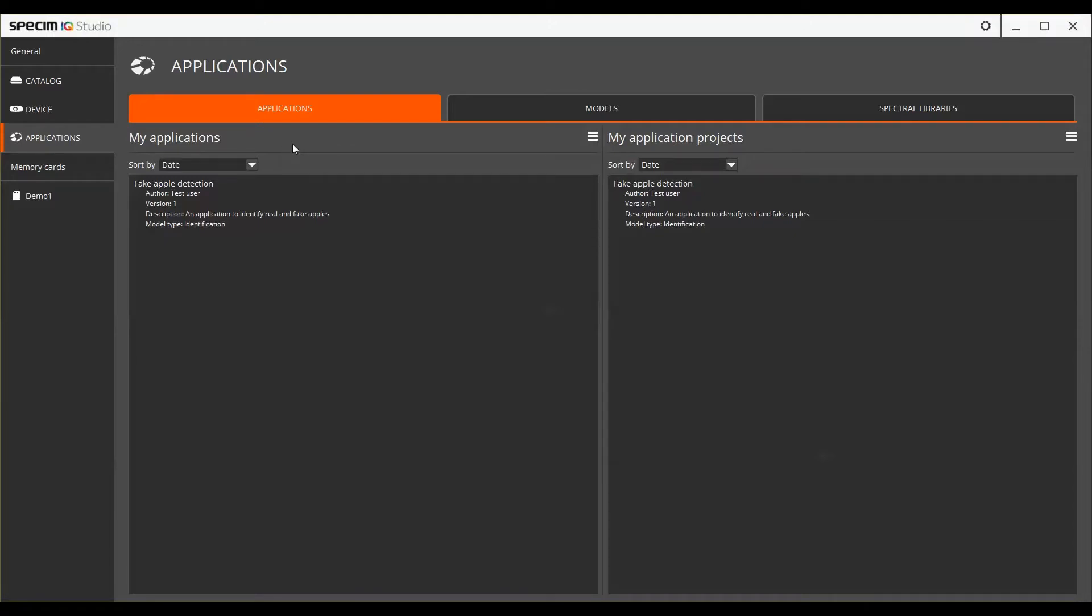Before going further into Models and Applications view, let's see a graph explaining the hierarchy and relations between models, applications and profiles.